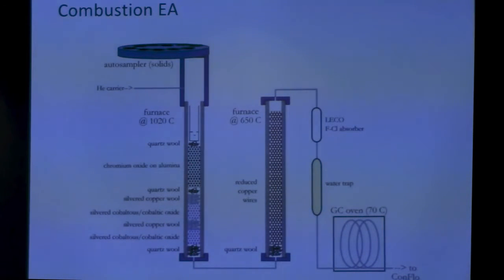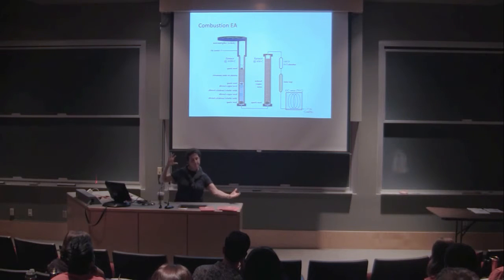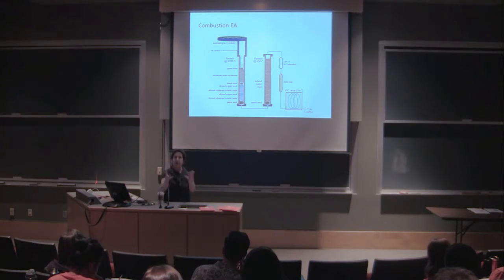So this is a continuous flow technique, and it actually includes some gas chromatography in it, even though we're measuring bulk materials. So that's a very successful device. And the discipline for a long time was really driven by people who wanted to put big samples into their EA, that they thought this is good because then we can kind of get a representative number for this whole thing.